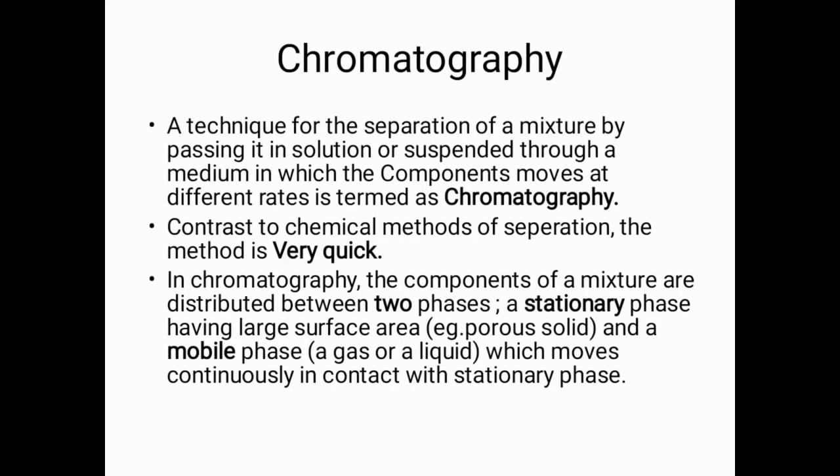Today, I am going to discuss in detail about gas chromatography. As we know, a technique used for the separation of a mixture by passing it in a solution or suspending it through a medium in which the components move at different rates is termed chromatography. In contrast to other chemical methods of separation, this analytical technique is very quick.